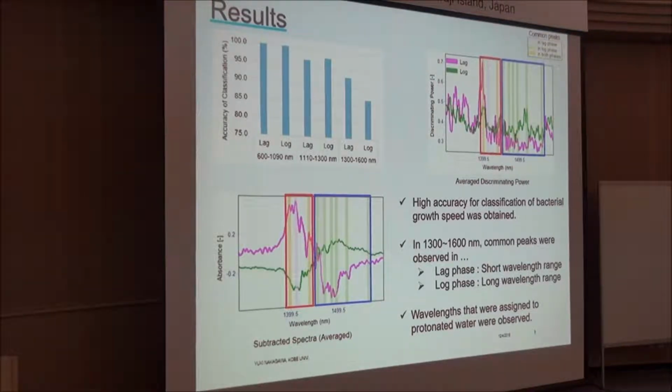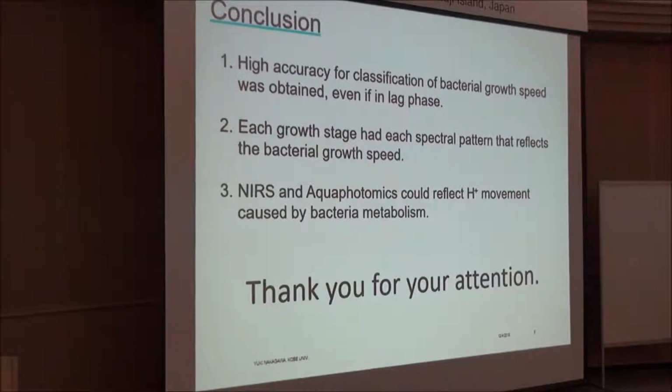And when doing assignment of common peaks, we discovered specific protonated water absorbance bands. These results were consistent with the fact that protons are very important for bacterial metabolism. From these results, we got the following conclusions. Thank you very much.